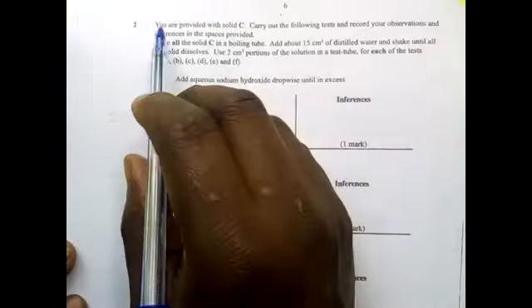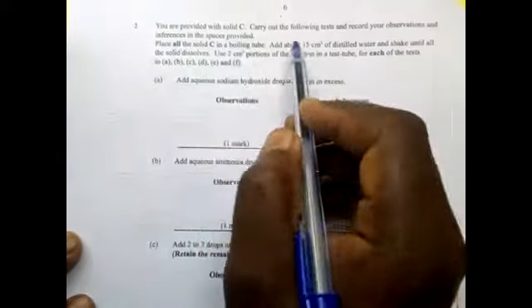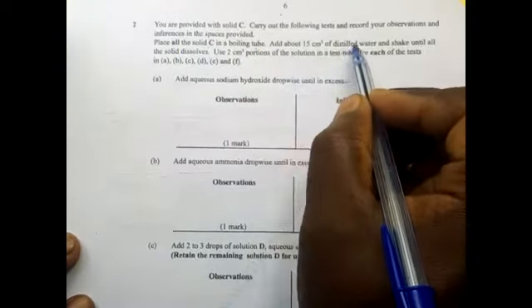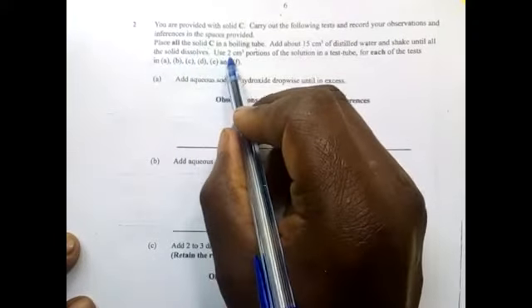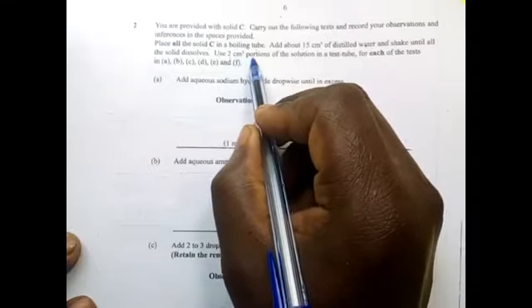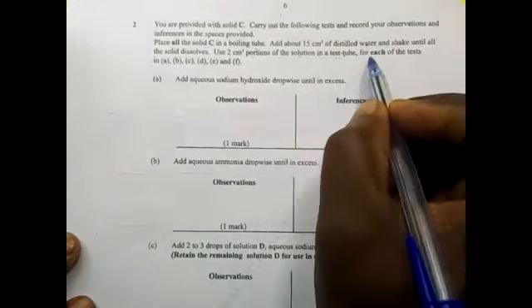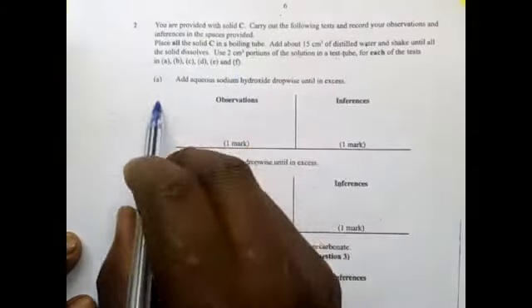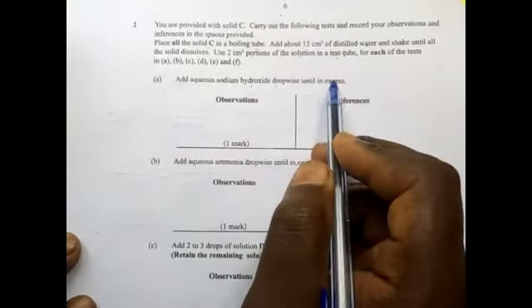Quickly, let me take you through the qualitative part of it. We have been given solid C. Place all solid C in a boiling tube. Add 15 centimeters cube of distilled water and shake until all the solid dissolves. Use 2 centimeters cube portion of the solution in a test tube for each of the following tests A up to F. A. Add aqueous sodium hydroxide dropwise until in excess.